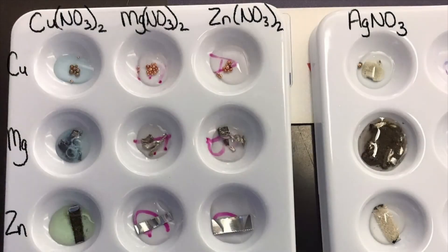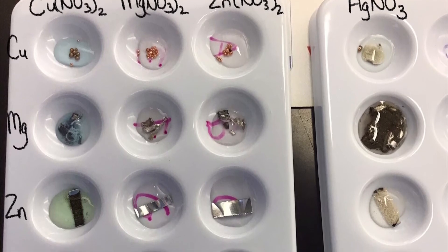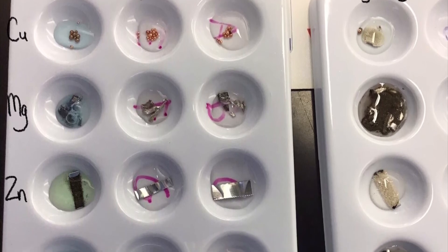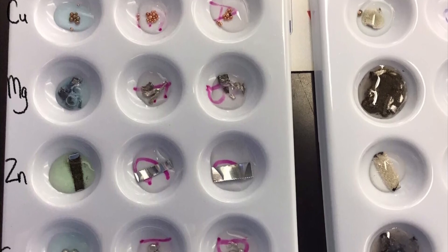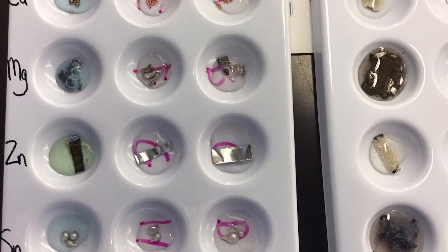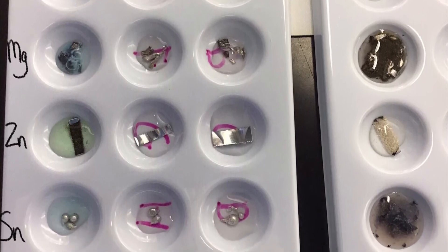You'll want to pause and rewind to record our results. In this image we can see all of our results laid out in the exact same order as they are in your data table. Take a few minutes to pause the video and record the results of what you see for each of the reactions. Look for bubbles and color changes.